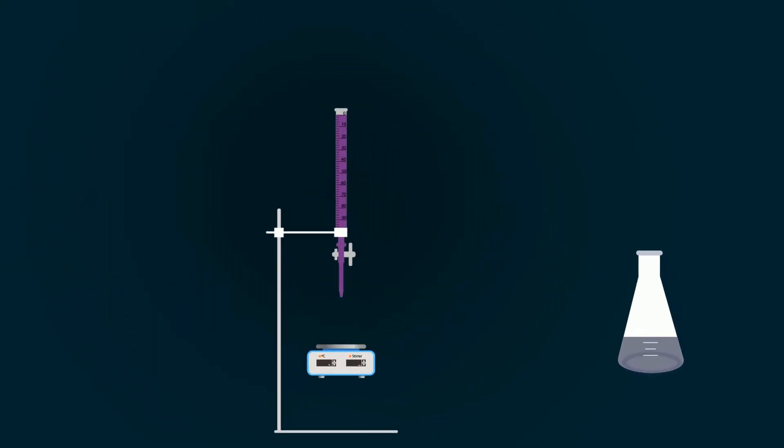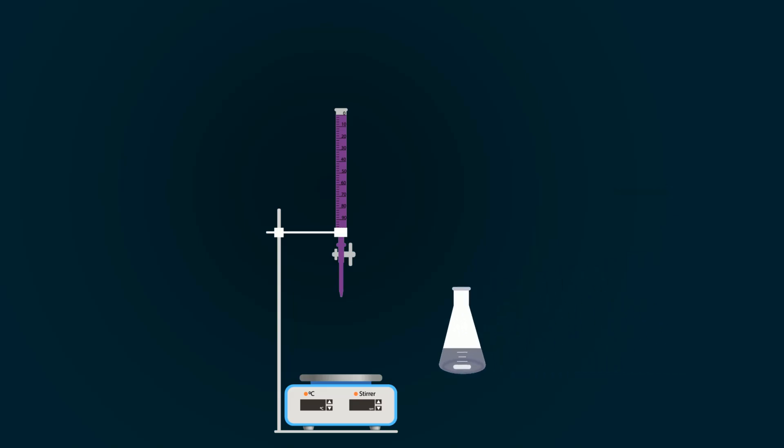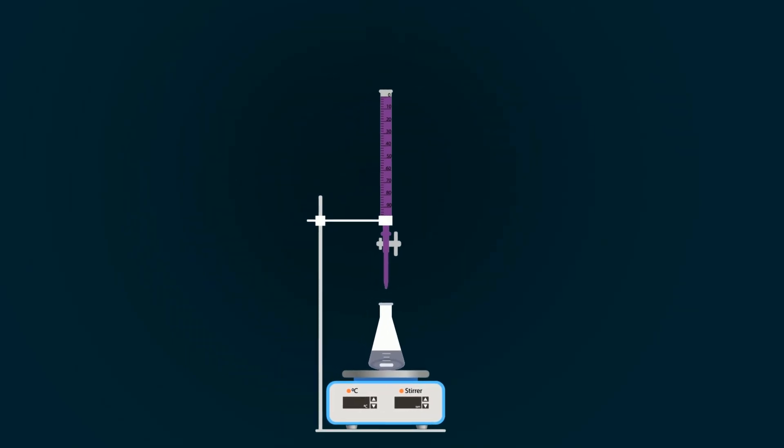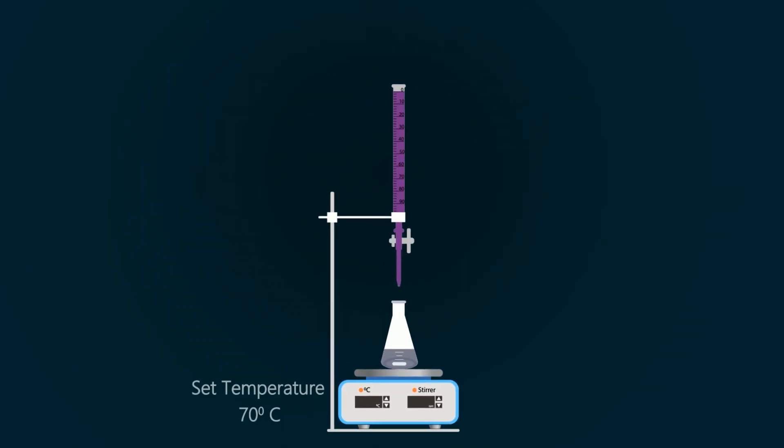Take magnetic stirrer plus heater, put magnetic bar into the conical flask. Put this conical flask onto the magnetic stirrer plus heater. Adjust the temperature to 70 degrees Celsius and set the speed or RPM up to your requirement.